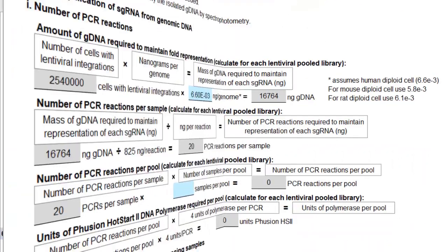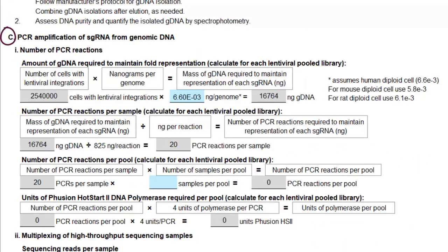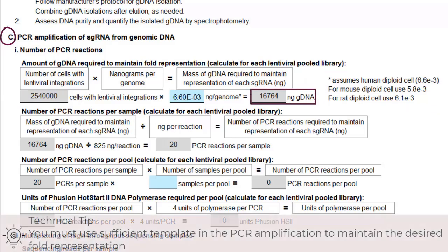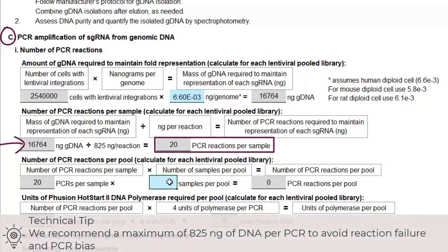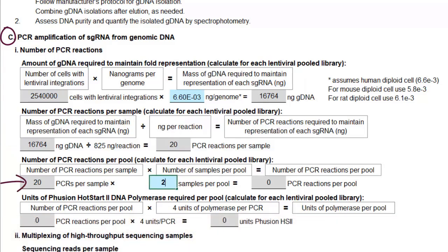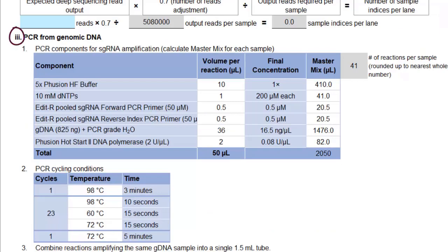Now we are onto the primary screen in Part C. In Part 1, we calculate the amount of genomic DNA, primers, and reagents needed for PCR prior to NGS. The tool has the number of cells with lentiviral integrations and multiplies it by the amount of DNA in a human diploid cell, then calculates the amount of genomic DNA we need to maintain representation of each sgRNA, and then calculates how many PCR reactions are needed per sample. We have two samples per pool because we have two biological replicates, so we need a total of 41 PCR reactions per pool. The tool calculates how much polymerase we need and puts this information into a table in Part 3 so that you can make your master mix.